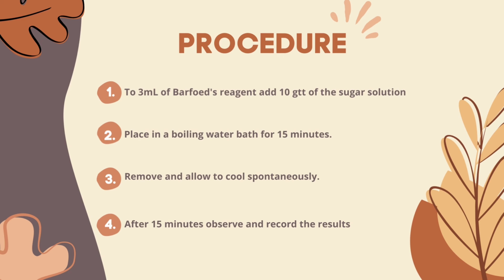Step 1. To 3 ml of Barfoed's reagent, add 10 drops of the sugar solution. Step 2. Place in a boiling water bath for 15 minutes. Step 3. Remove and allow to cool spontaneously. Lastly, Step 4. After 15 minutes, observe and record the results.